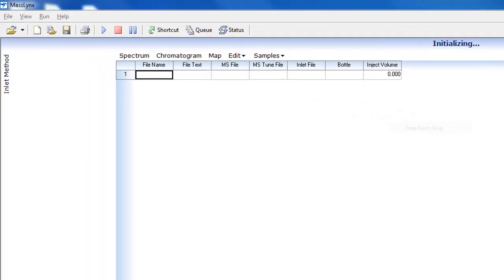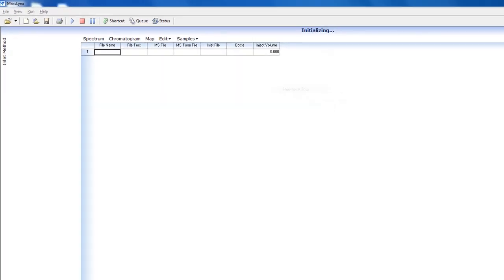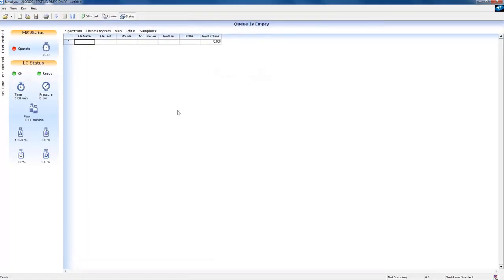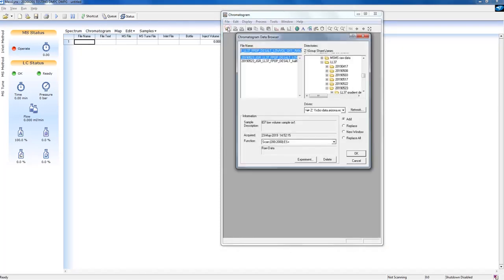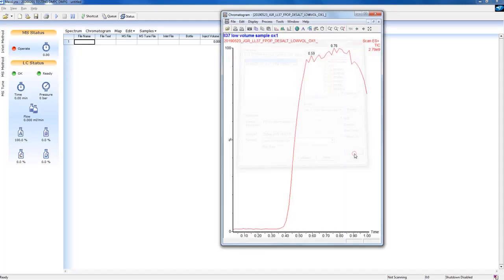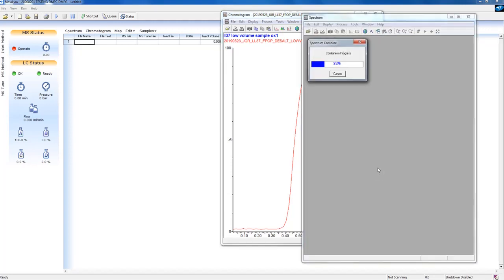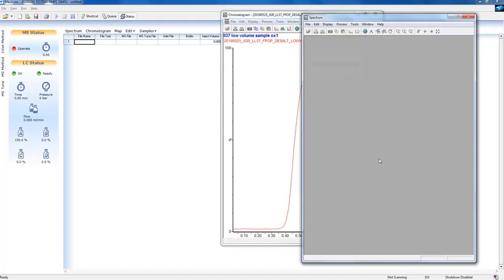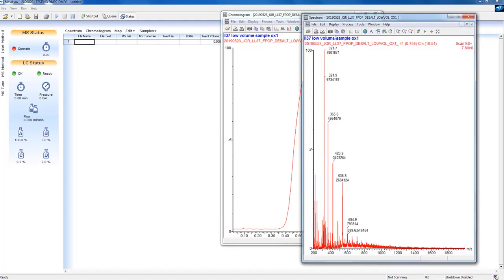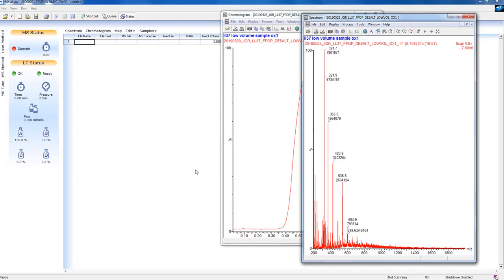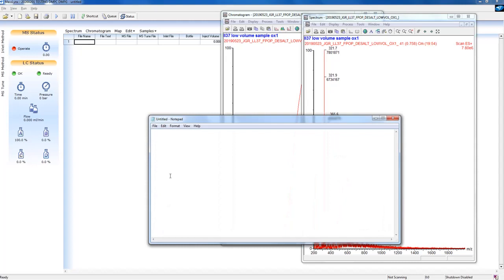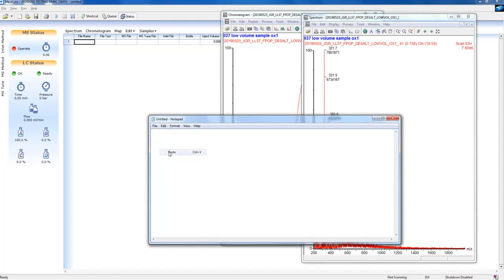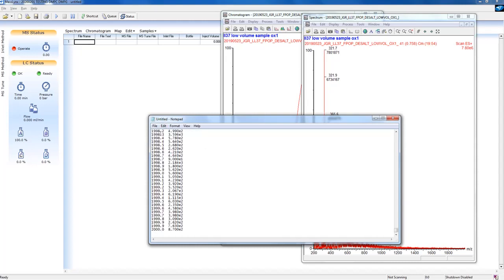For Waters users, you can easily copy-paste data from MassLinks into text files or directly into Unidec. Open Waters' MassLinks program. With your data open in the Chromatogram tab, select the region over which you would like to obtain a spectrum. Simply copy the spectrum list and save this as a text file, which you can then drag and drop into Unidec.